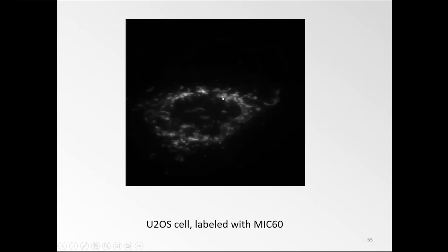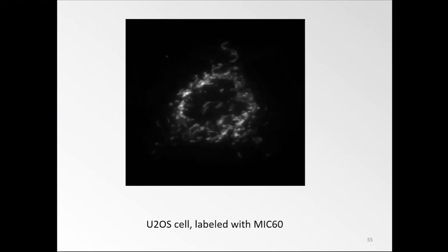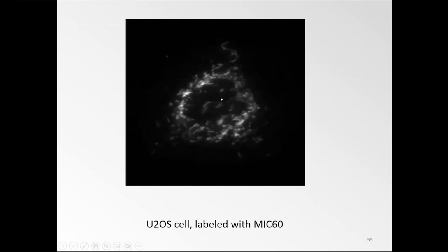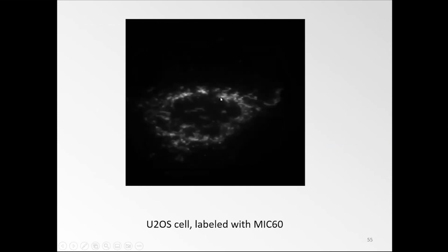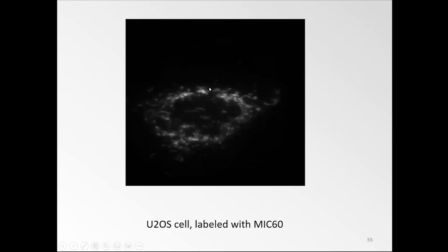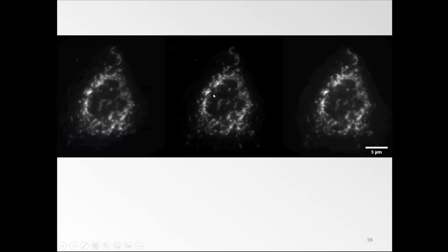So this is done here. These are actually projections of a cell with mitochondria under the 3 different orientations of the oblique structured light sheet, squished or projected exactly into the same coordinate frames parallel to the cover slip. So this is how the raw data looks. But if we co-register them, so squish them, rotate them, overlap them, then this actually looks much more like traditional SIM data. If you could zoom in, you could actually see that the patterns run in these different directions, and when you overlay them, the data overlaps quite nicely.